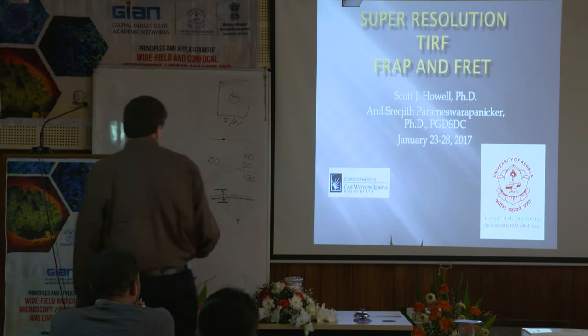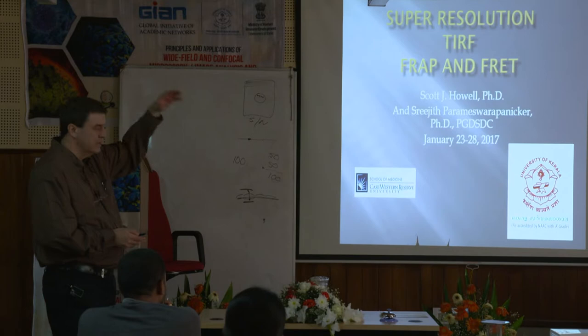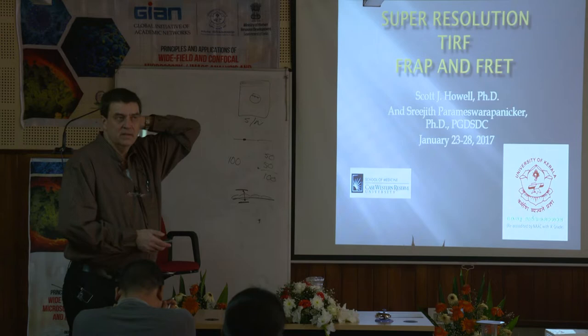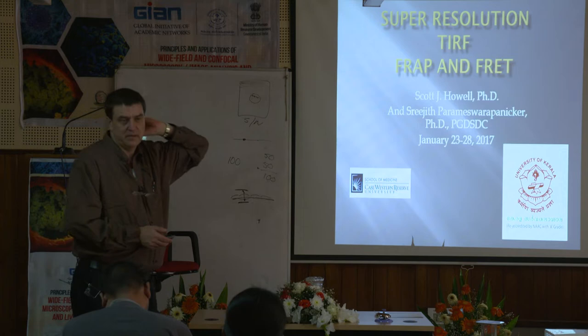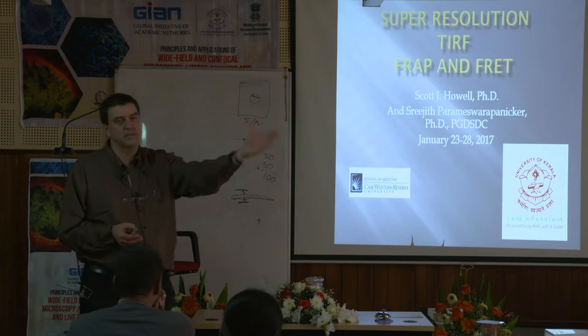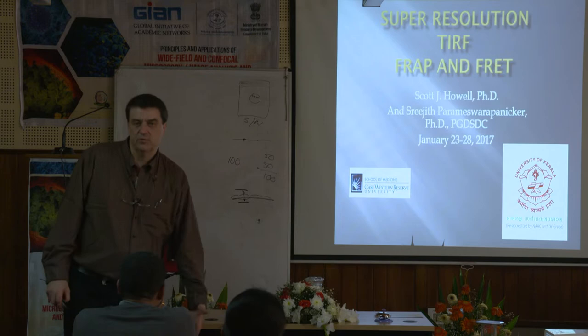Okay. So we're going to talk about super resolution, TIRF, FRAP, and FRET. The reason I talked about confocal first is confocal is a pretty good basis to get into some of these things. These are now a little bit more specialized techniques that you see quite a bit. I think I mentioned quite a few of these when we talked about trends in microscopy, and we'll just talk about them again. It's just so you know about them and you're aware of them. And if you see your research project, you might say, wait a second, maybe I can use something like this. So just an introduction to these techniques that you might be able to use in your future work.